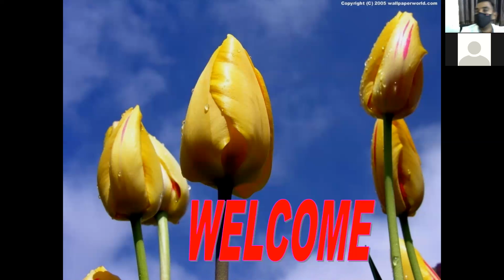This one is one of the practicals. It belongs to mycology. It is how the microscopical examination is seen for fungal microscopical slides and growth. How to prepare a fungal slide culture. Today we will see this topic.